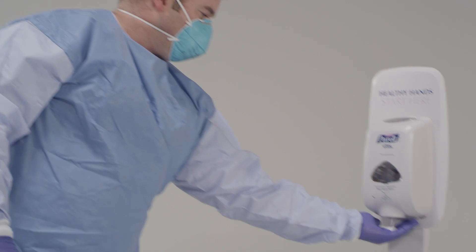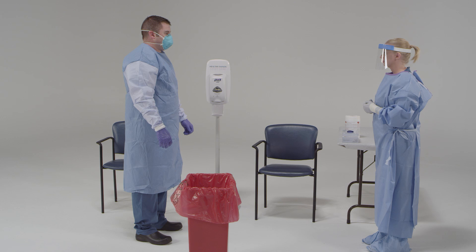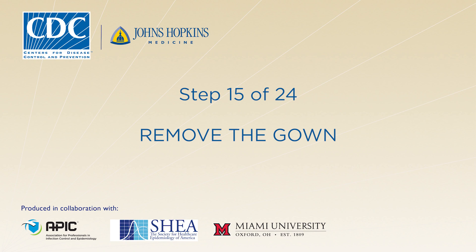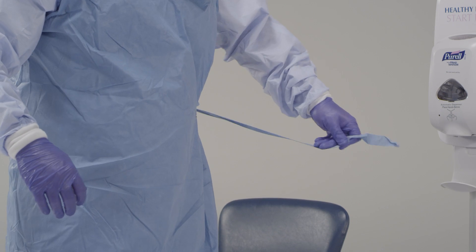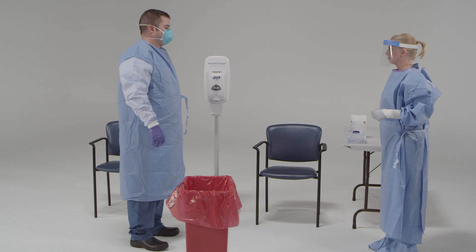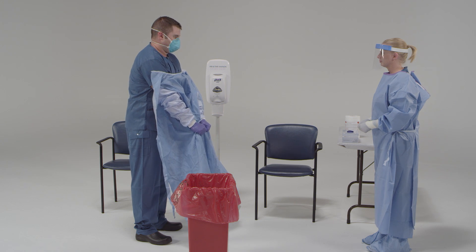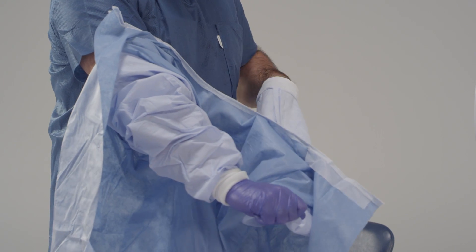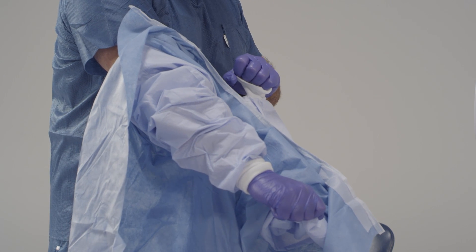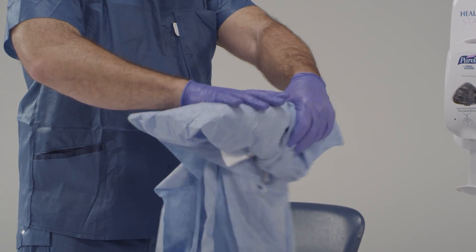Now disinfect your gloves. Go ahead and remove your gown. First, release the tie, then grasp the gown at the hip area and pull the gown down and away from the sides of your body. Once the gown is off your shoulders, pull one arm at a time from the sleeves of the gown. Then roll the exposed side of the gown inward until it's a tight ball. Dispose of it.